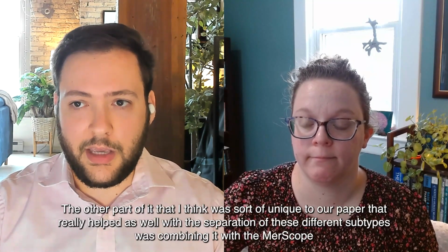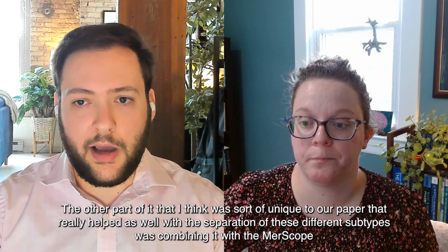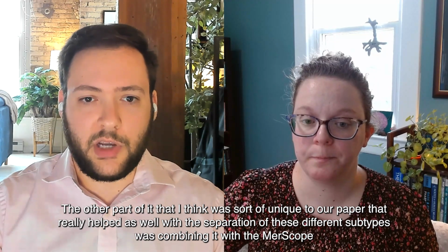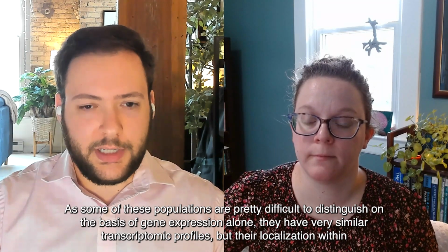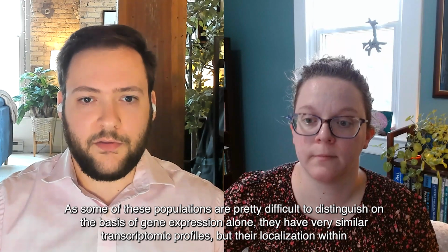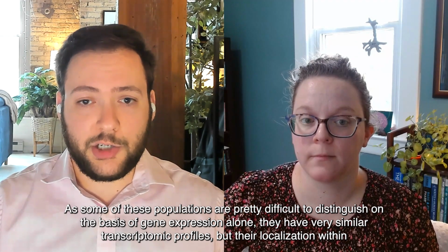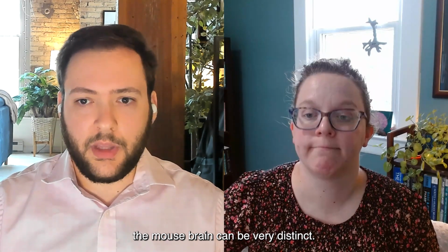And the other part of it that I think was sort of unique to our paper that really helped as well with the separation of these different subtypes was combining it with the MERScope data. As some of these populations are pretty difficult to distinguish on the basis of gene expression alone. They have very similar transcriptomic profiles, but their localization within the mouse brain can be very distinct.